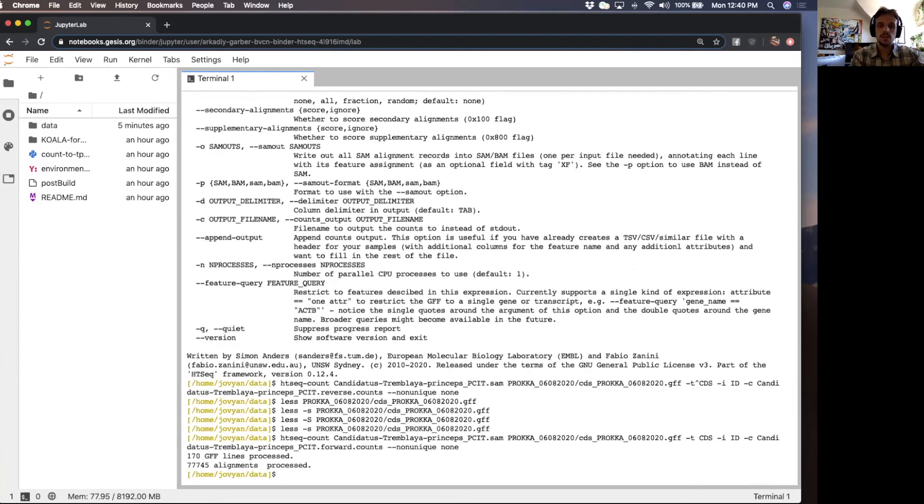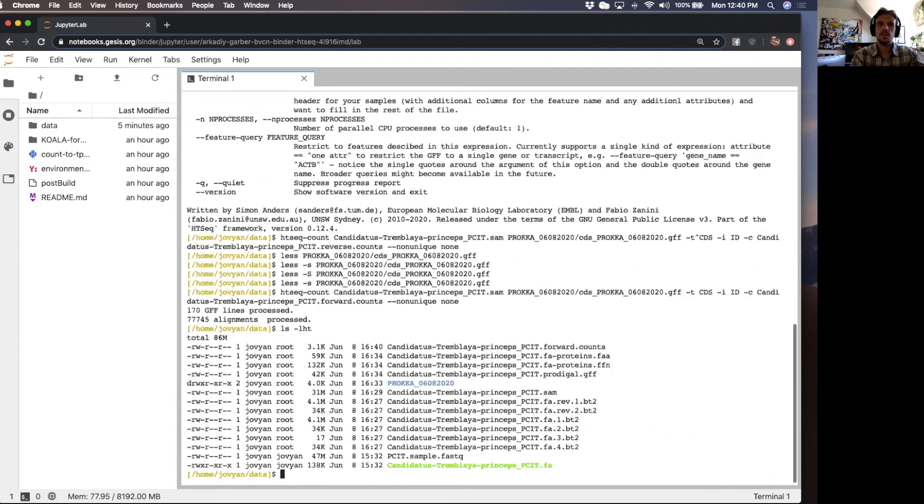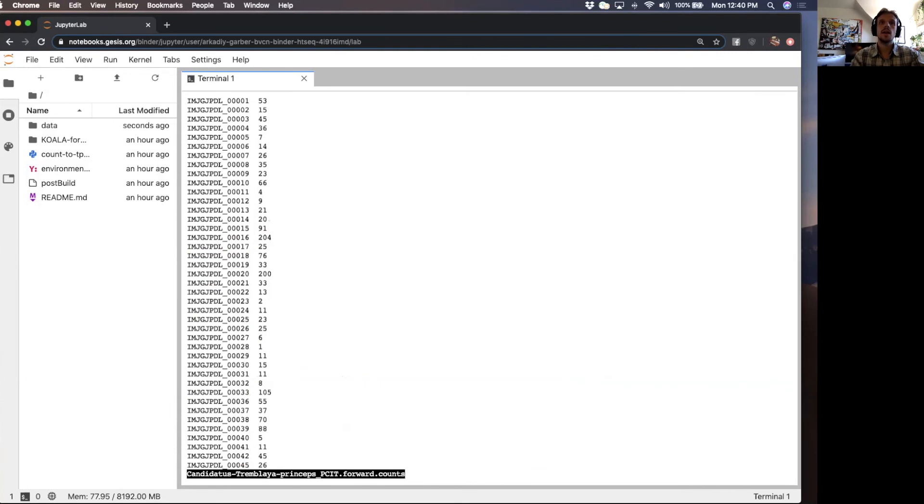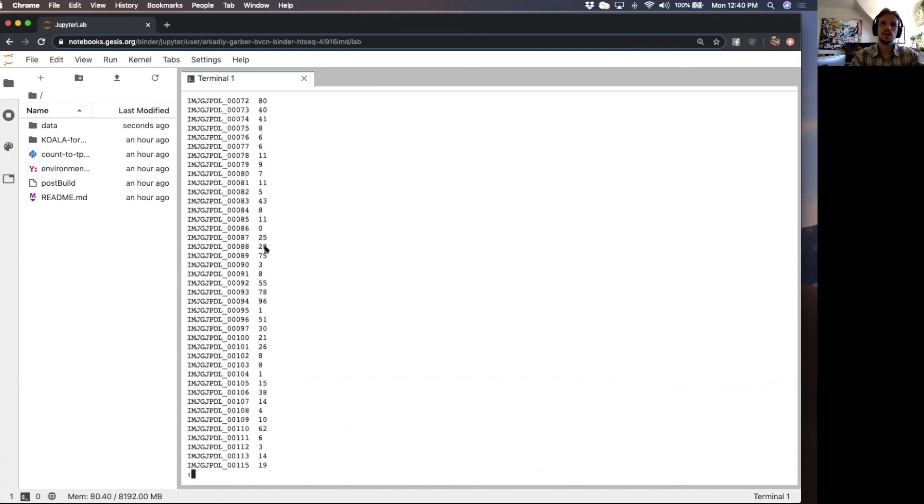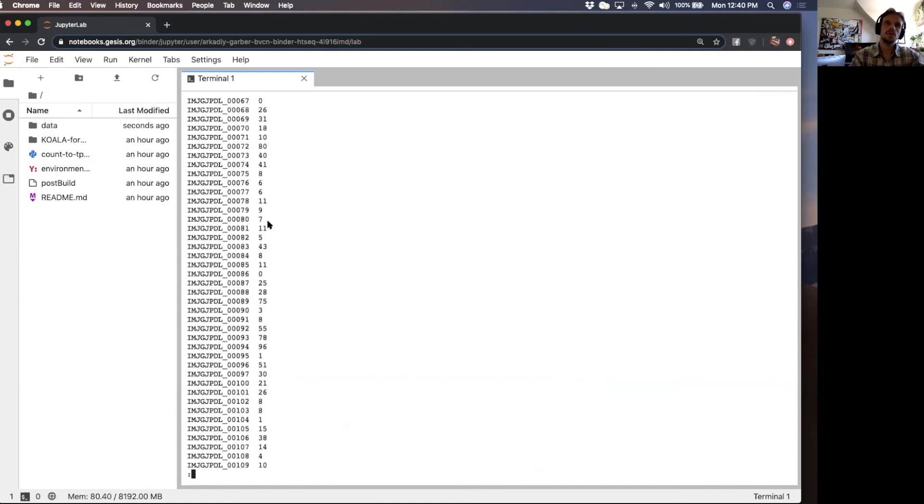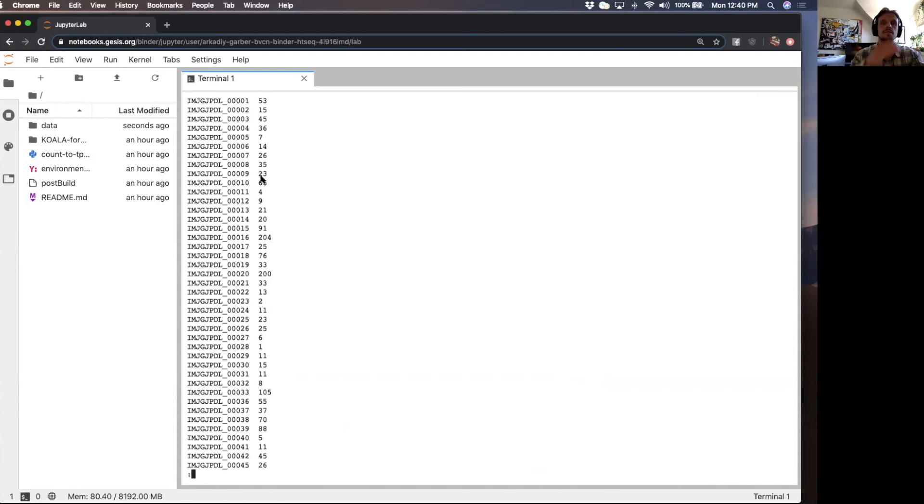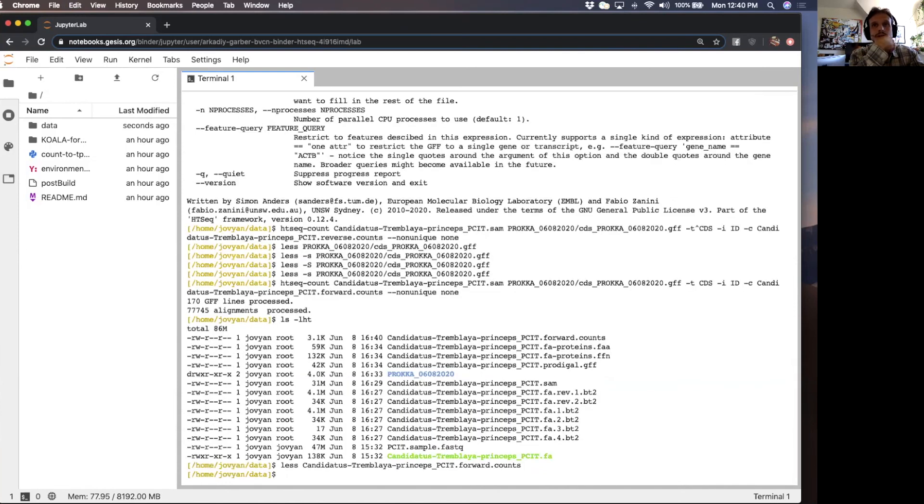It's finished. We see that we have a file here that it created. The first column are the locus tags and the second column are the read counts. The read counts are low here because I am using only a very small subset of the RNA-seq data. So those are forward counts.